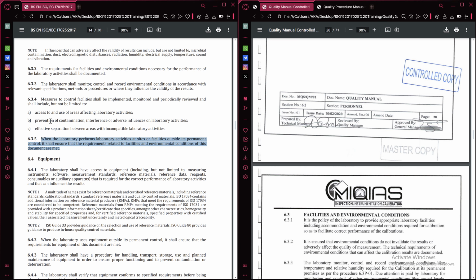it's fine. Inside your lab, you've applied many steps that will make sure your lab is suitable enough for a test. But what about if you do this outside your lab? Well, basically you'll have to do everything that you did in your lab outside. You'll have to make sure that your facility still is a good place and you can work in it smoothly. And you'll have to make sure that the environment inside your facility still allows for testing that is not influenced or affected by the environment.